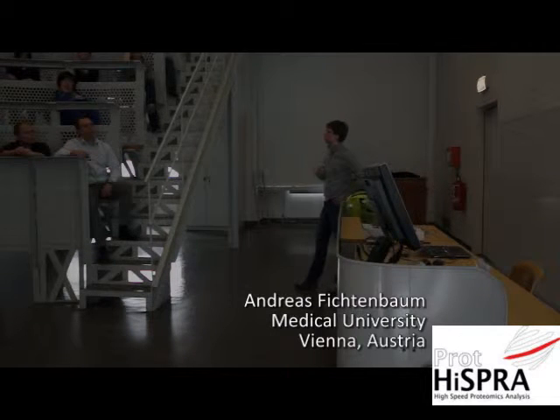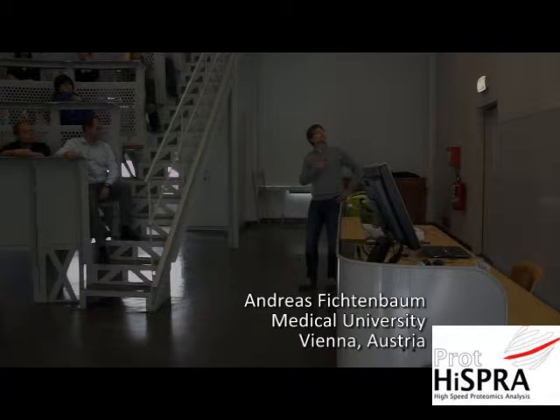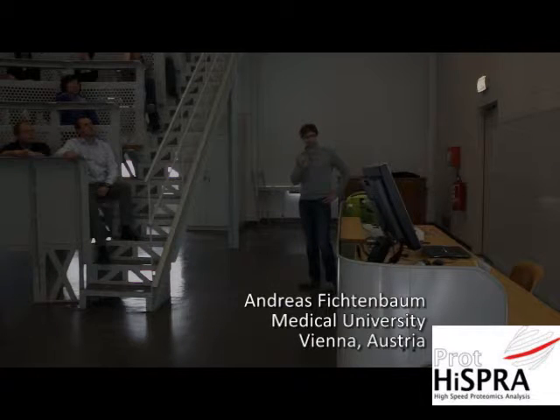This contains the wash fractions, and the elution fractions were combined. And this is the column with the nano-titanium particles. In red, you can see the phosphorylated and the non-phosphorylated in blue.